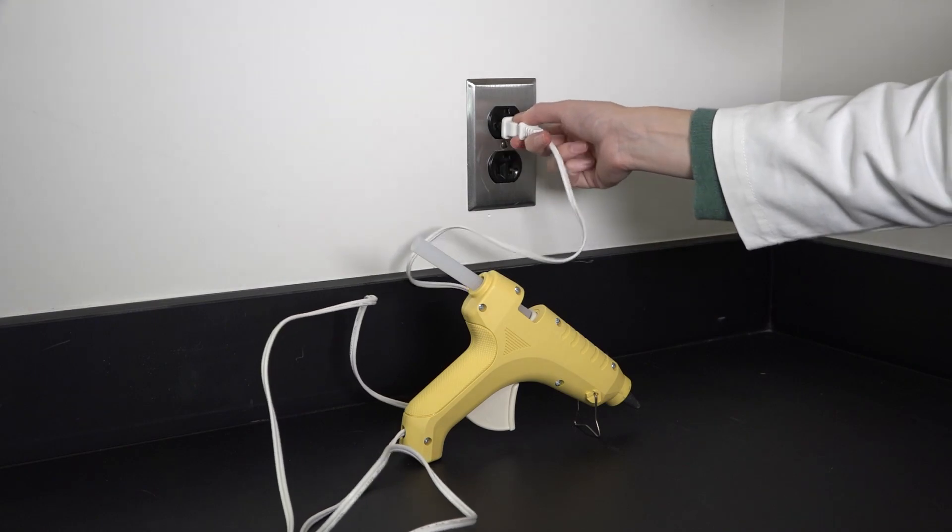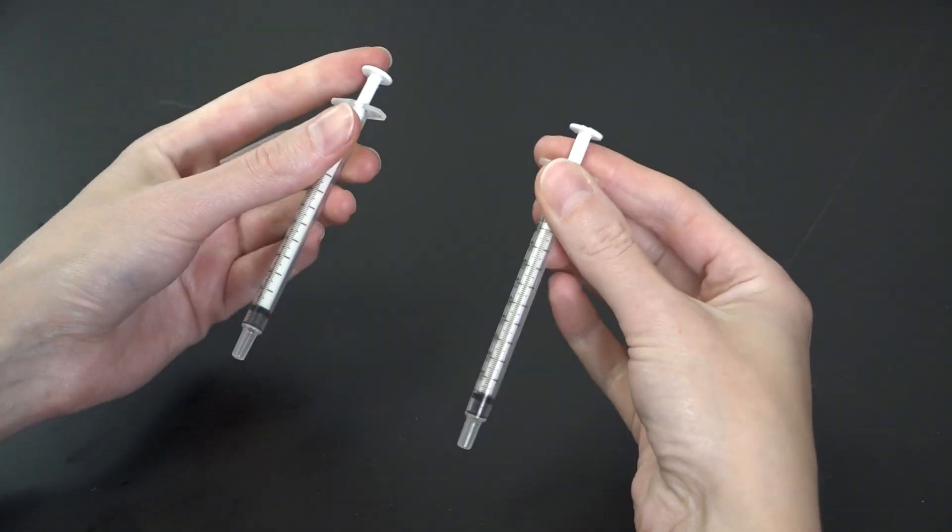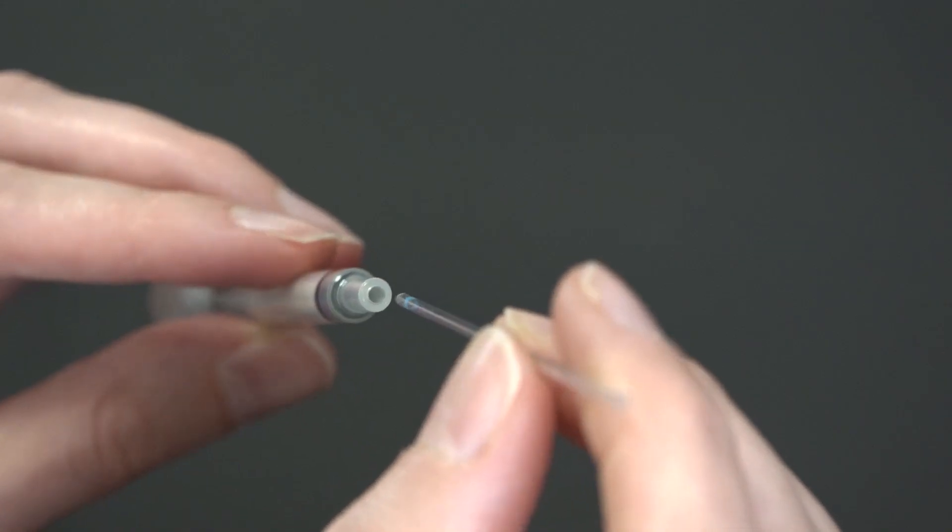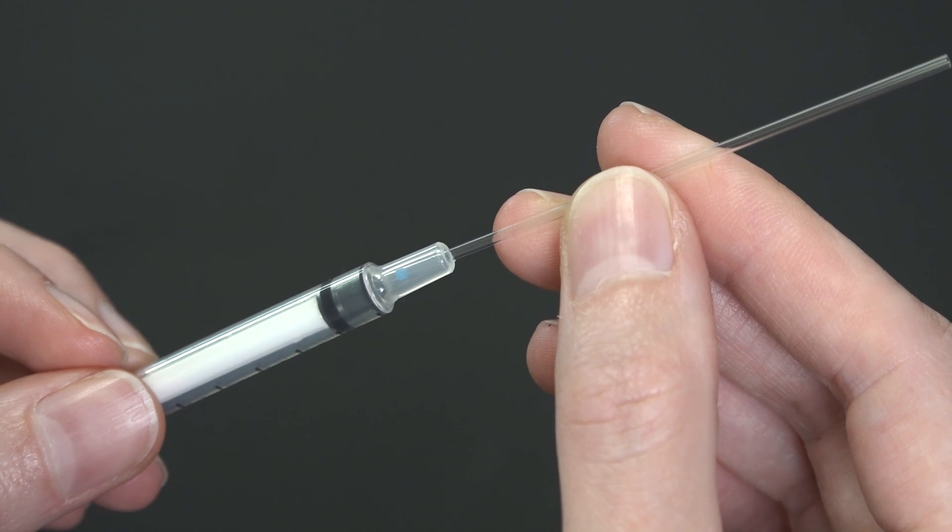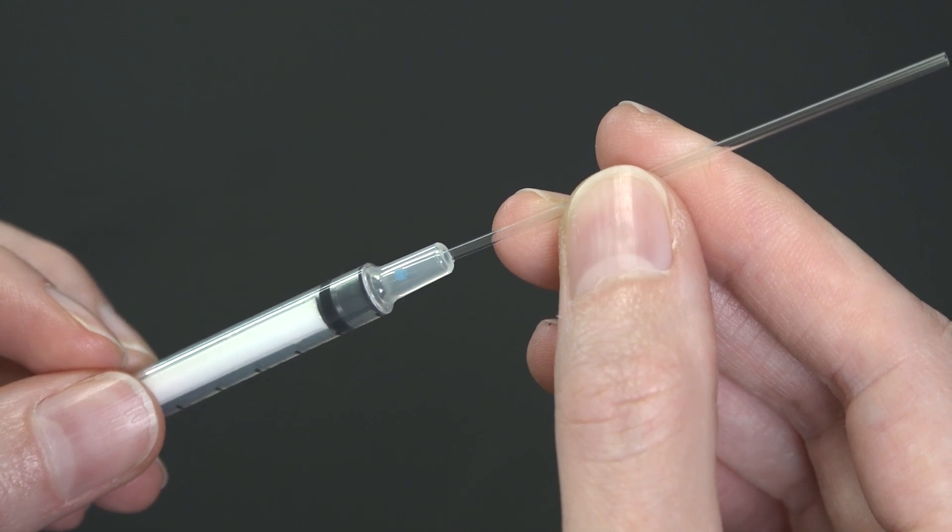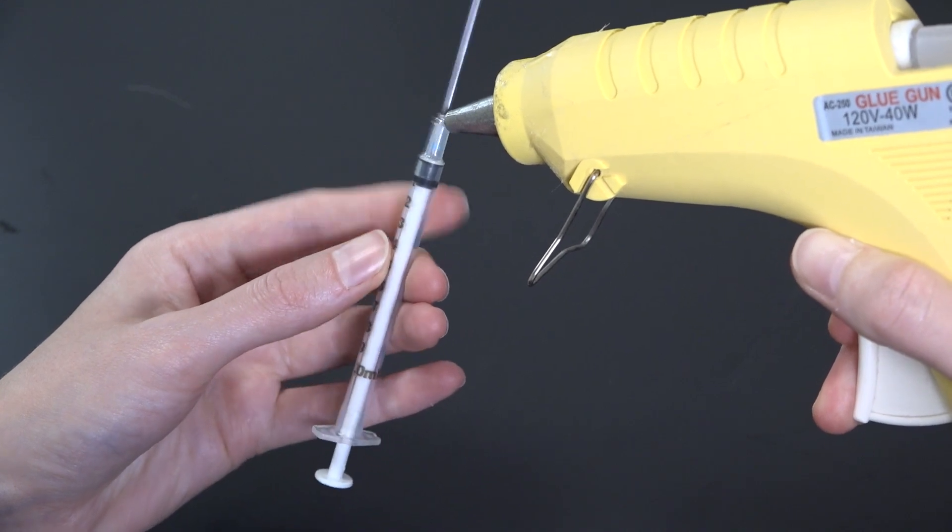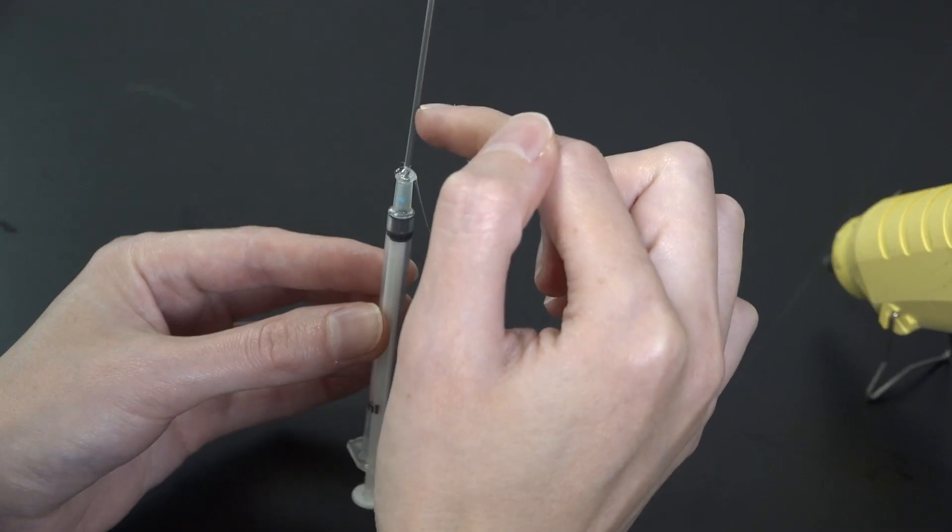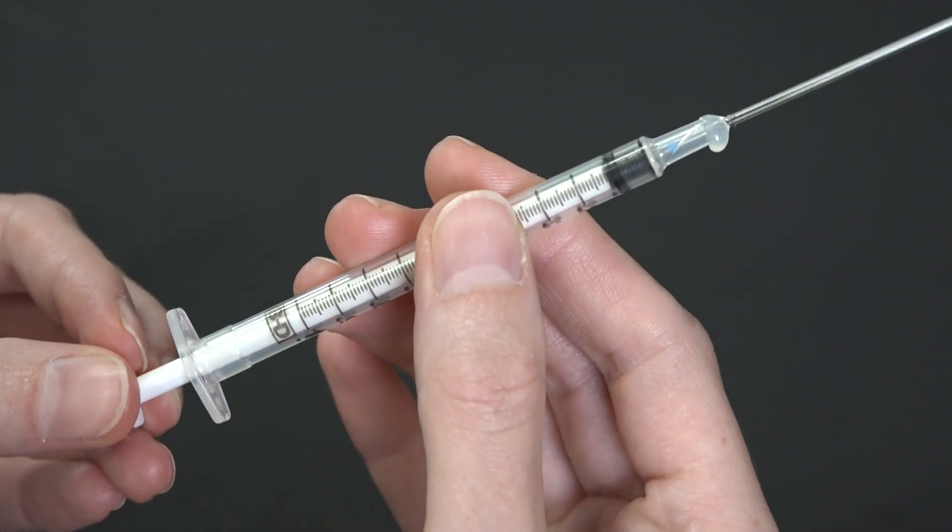First, while I warm up my glue gun, I'll make sure the plungers of my syringes are pushed all the way in. Then I'll insert a capillary tube into the syringe where the needle usually goes, making sure it slides all the way to the plunger tip. Next, I'll seal the place where the capillary tube meets the syringe with hot glue, keeping the capillary tube sticking straight up until it cools. I'll know I did it right if I can pull back on the plunger.